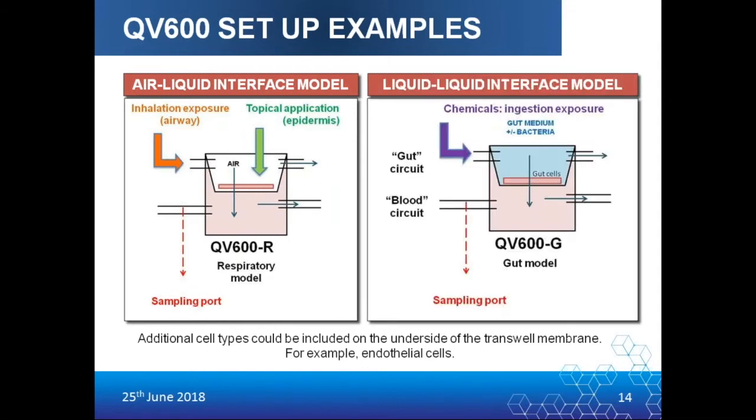On the right-hand side is the liquid-liquid interface model, where media is flowing through both upper and lower compartments. For example, a gut epithelium model that could be treated with gut microbes.